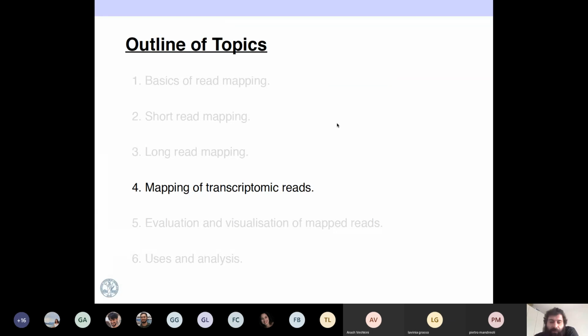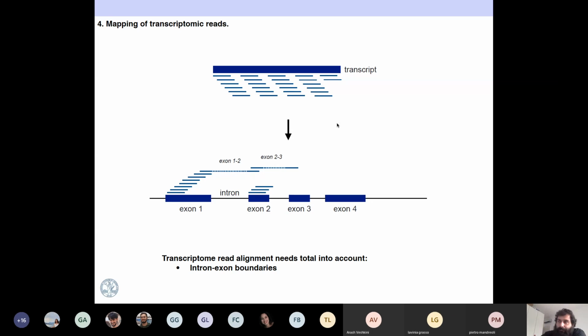Still, there are some specific protocols to map microRNAs. A few years ago, if you wanted to analyze microRNA, you used bowtie. You didn't care to use TopHat, for example, which is a gapped aligner, because maybe you were introducing too much noise. But now that you have better aligners like HiSat that can deal with everything, you use HiSat. So I will talk about that.